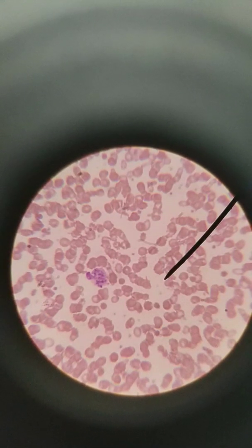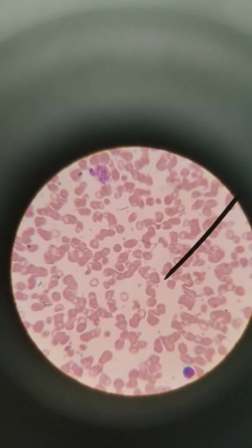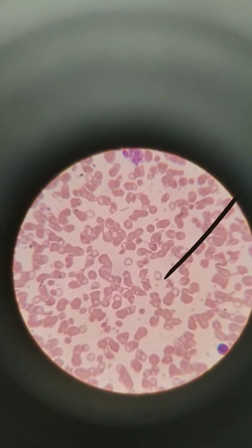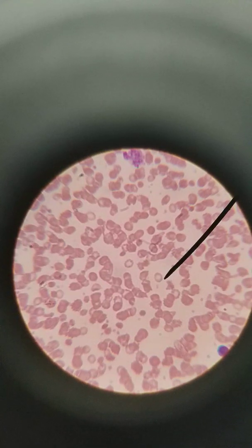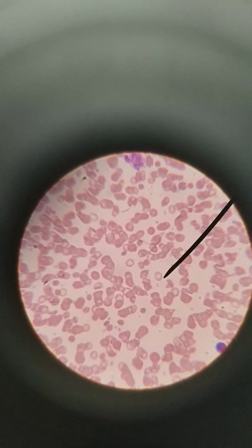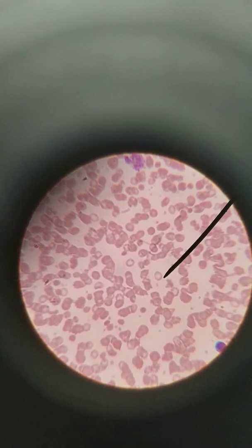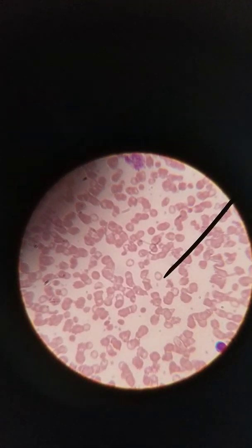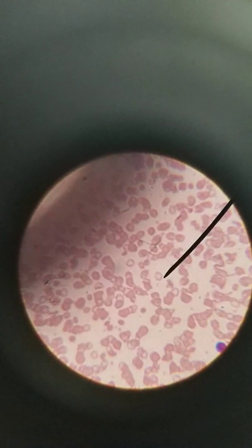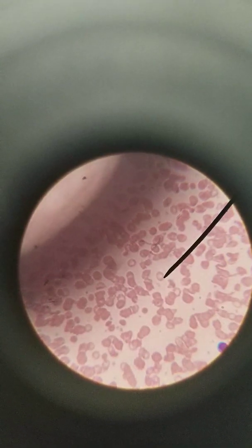So in this slide, it's easiest if we see the ones that are out on their own. I don't know if you can remember what the shape of a normal red blood cell was, but it was obviously round, but I mean the size of it. The erythrocyte that you see here that I'm pointing at, it is roundish, sure.